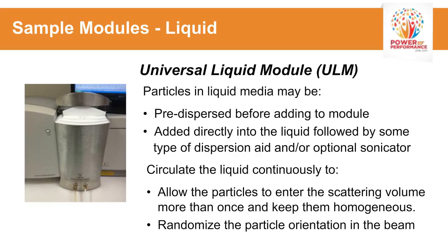You're continually keeping the particles suspended, so you have a homogeneous mixture, and these are passing the laser beam multiple times, so we can definitely get a good picture of what the light scatter intensity distribution looks like, so we can then calculate the appropriate particle size.